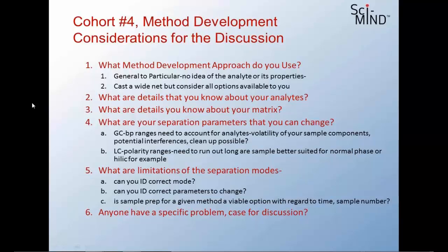The other thing is to look at your parameters. What's available for you to change? What are the variables in your GC? You're going to look at, someone mentioned a cold finger and essentially using a temperature gradient, what columns you have available to you, what thicknesses, lengths. What are other options? Split mode, what kind of injector are you using? Splitless.